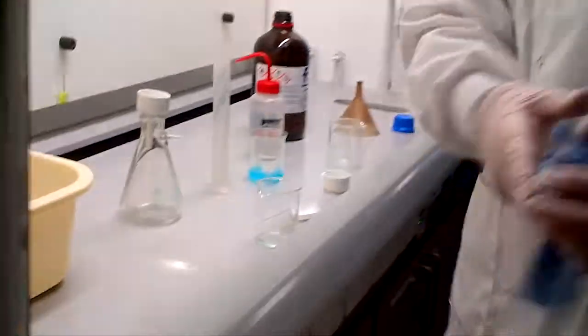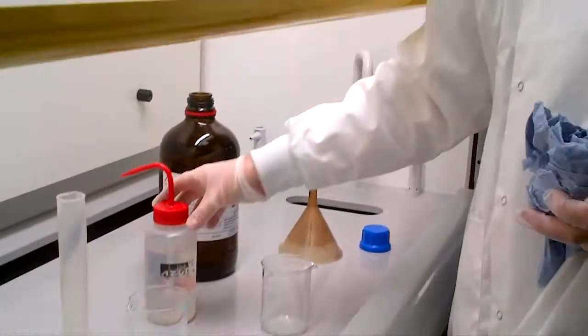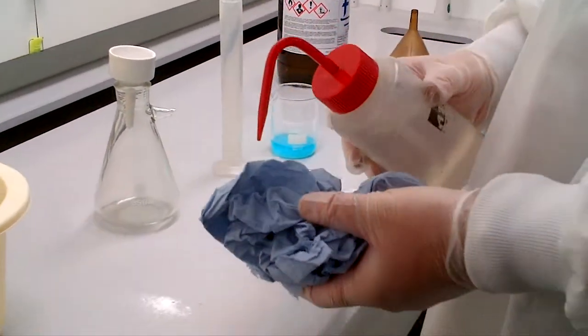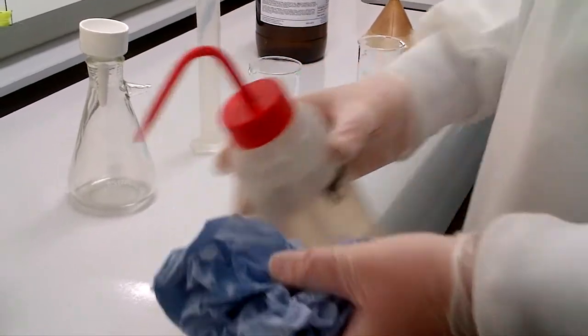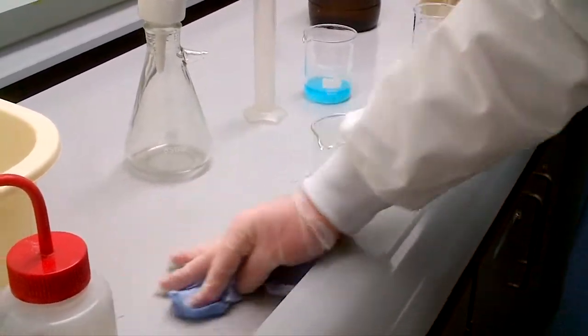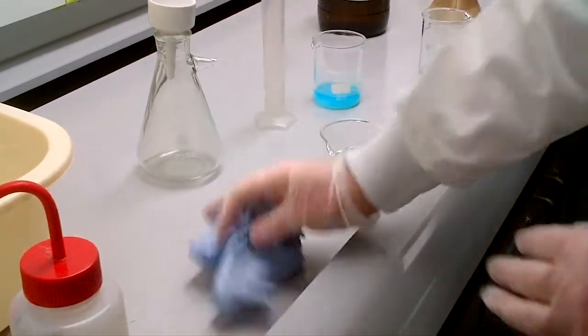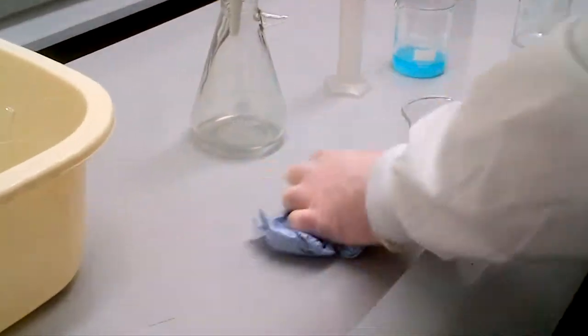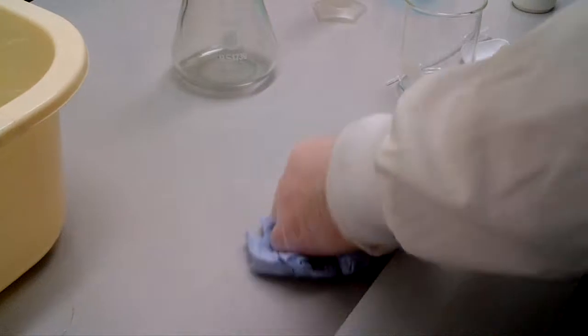Let's say this is organic based. How do you clean that up on tissue paper? Put some acetone on. Let's say we'll take some acetone. We'll clean up as much as possible with paper towel. And again, acetone the area as appropriate. Clean up all your spillages. So clean up your fume cupboard bay of organic, inorganic, and paper towel.